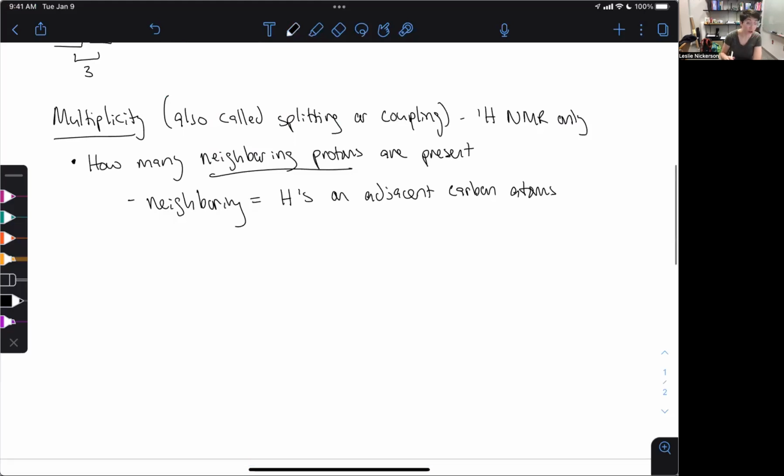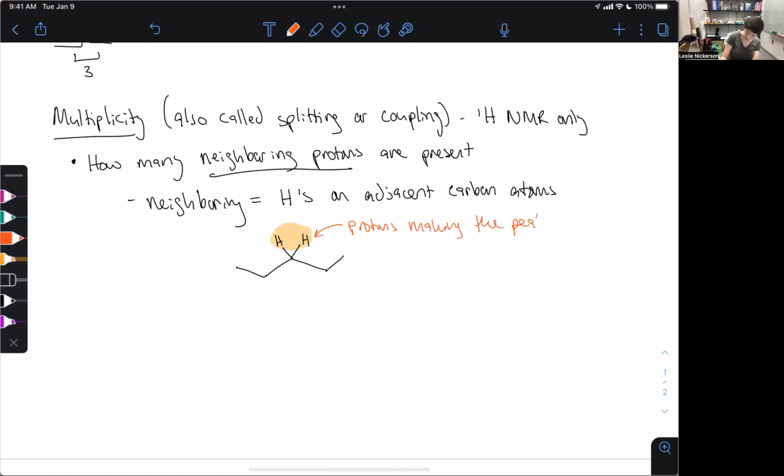Okay, so let's look at a situation here where we just have a CH2. Okay, so if I'm looking at this, these are going to be the ones that I'm looking at for my peak. Okay, those are going to be the ones that I'm using as my peak.